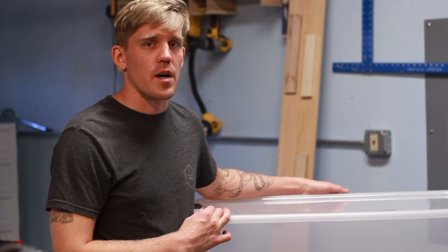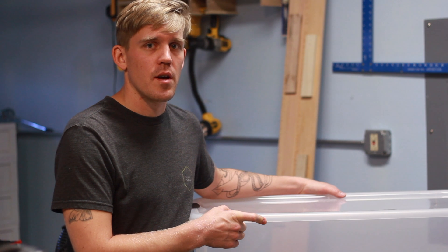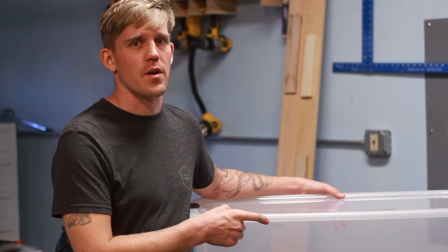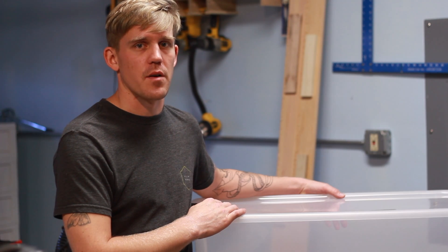We're going to use this giant sterile container. It's a 116 quart container and I wanted a container that's big enough so I can put multiple bags of substrate in it at the same time and I don't have to keep opening and closing the box to bring stuff in and out.